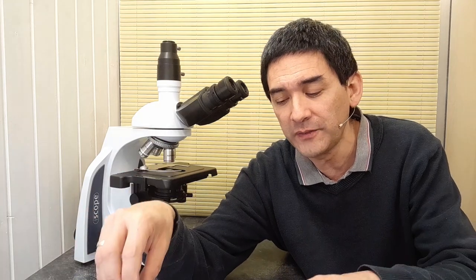And especially when you're starting out with microscopy, I generally recommend that you do not invest too much at the beginning, because you need to gain experience first and then you can always upgrade to something better and microscopes like the Swift SW380T and with similar microscopes, essentially they're pretty much the same concerning image quality. But if you want to have more, then essentially you're actually going up a significant step.